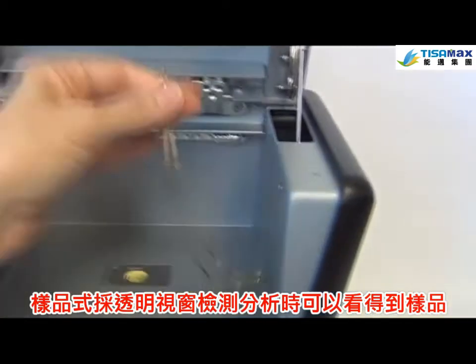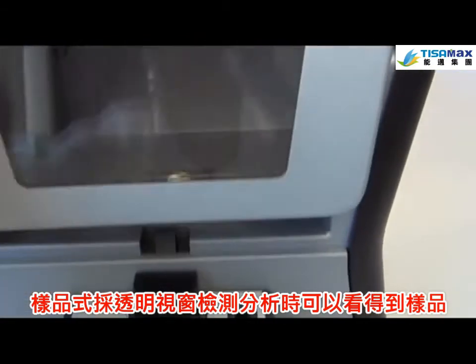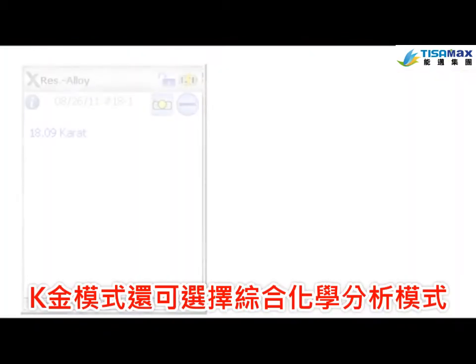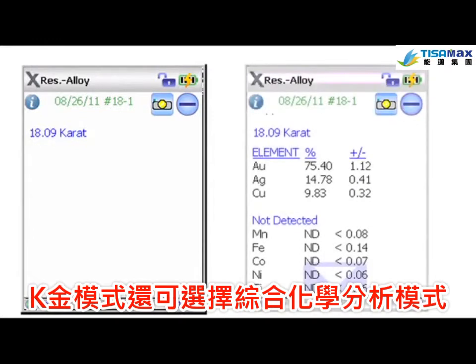The Gold Expert's viewing window and well-lit chamber allows both operator and customer to see the sample as it is being analyzed. Karat mode, or the more comprehensive chemistry analysis mode, can be selected.